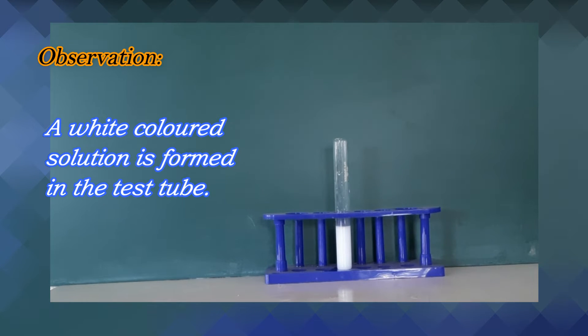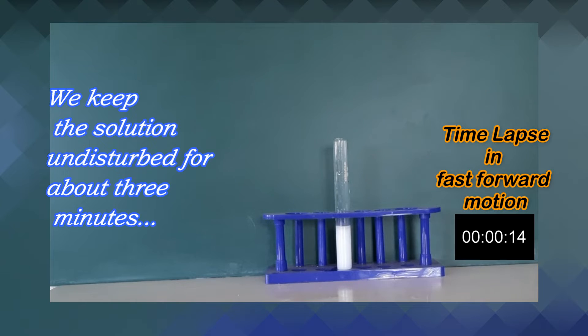Observation: A white coloured solution is formed in the test tube. We keep the solution undisturbed for about 3 minutes. Time lapse in fast forward motion.